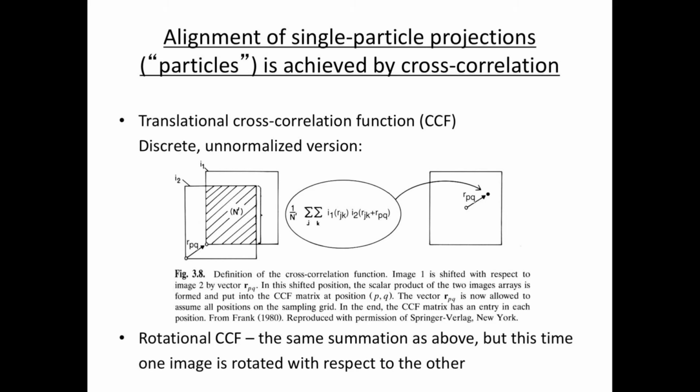You make a note of this, and that is one single value. And that single value you plot into a two-dimensional matrix at the point that indicates this shift vector. So performing this entire sum or making this observation gets you one single value only.